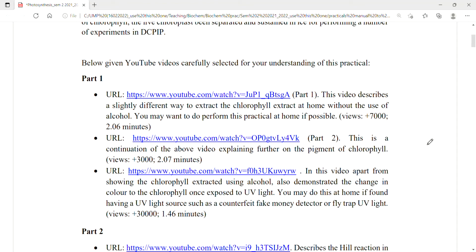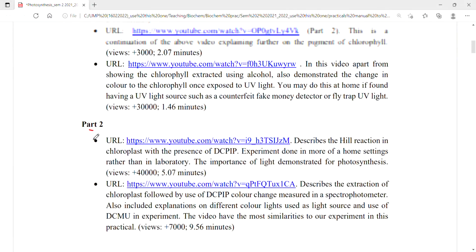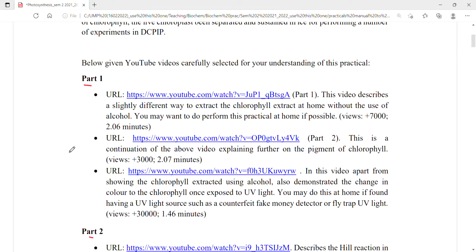Since we can't do the experiment in the laboratory, I have managed to obtain 3 videos for part 1 and 2 videos for part 2. Try to watch these videos to understand. For instance, the first video, which is part 1 of part 1, explains the chlorophyll extract.